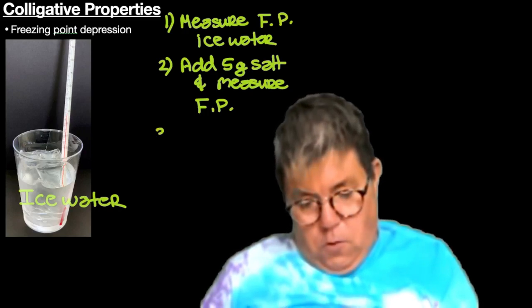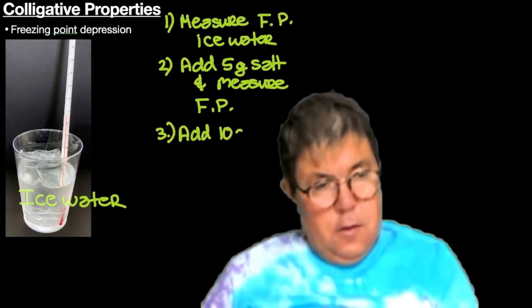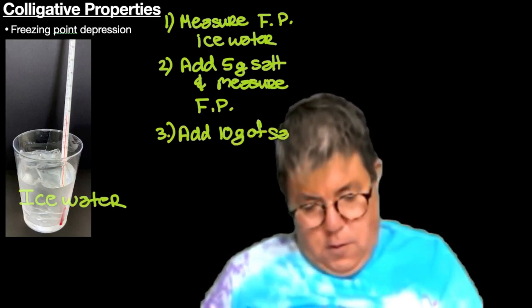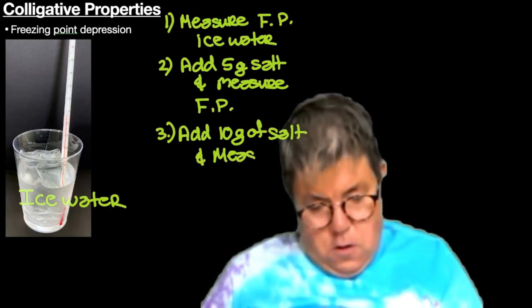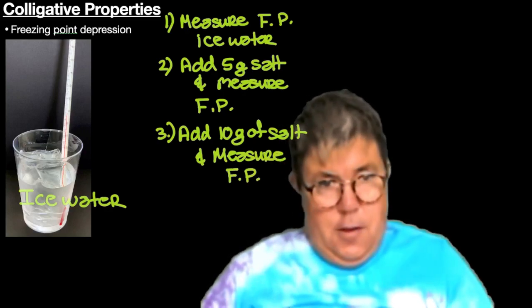Third, we're going to add 10 grams of salt, and we're going to measure the freezing point again.